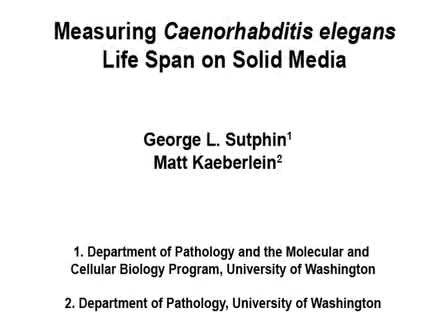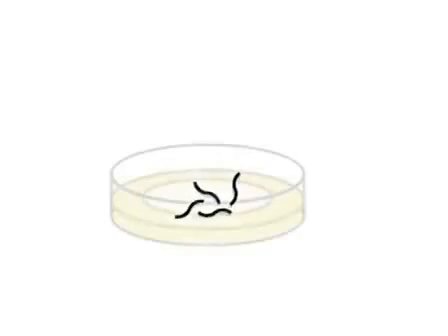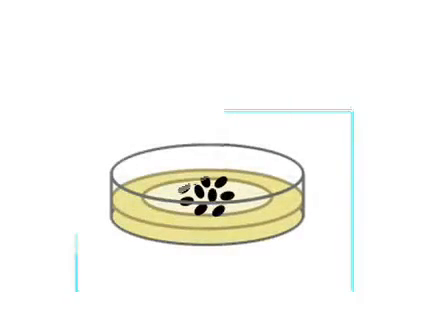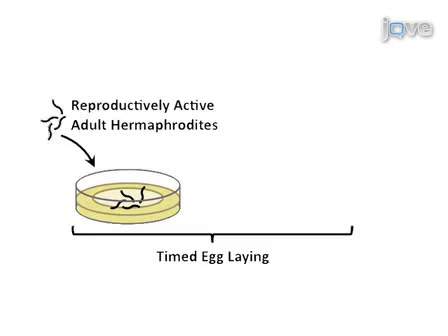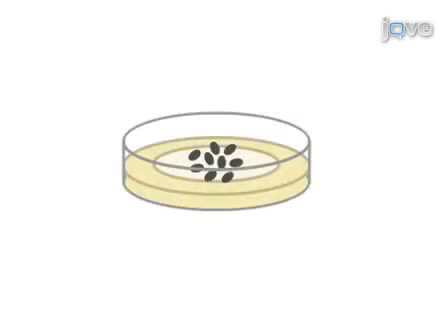In order to measure lifespan in C. elegans, an age-synchronized population is generated using a timed egg-laying. Reproductively active adult hermaphrodite worms are transferred onto nematode growth media plates seeded with UV-killed E. coli, allowed to lay eggs for 6 to 8 hours, and then removed. Over the next 2 days, worms hatch from these eggs and grow to the L4 larval stage.